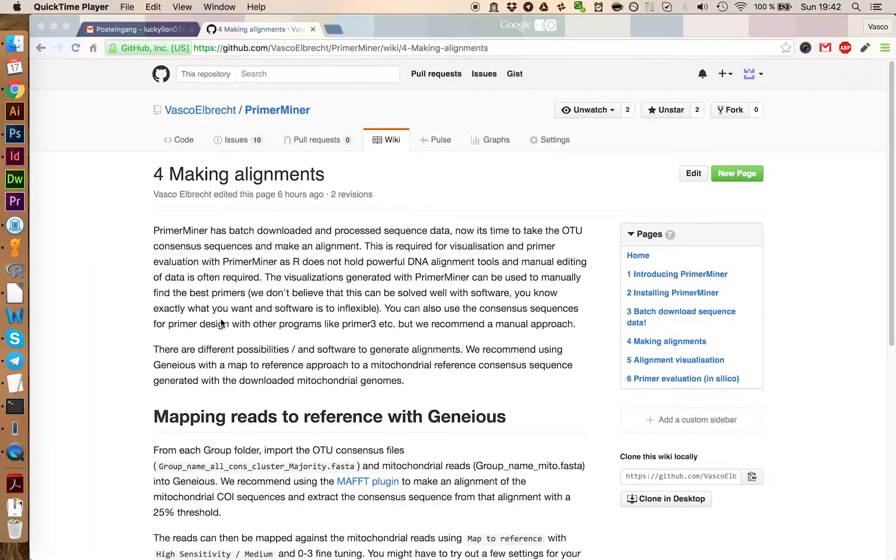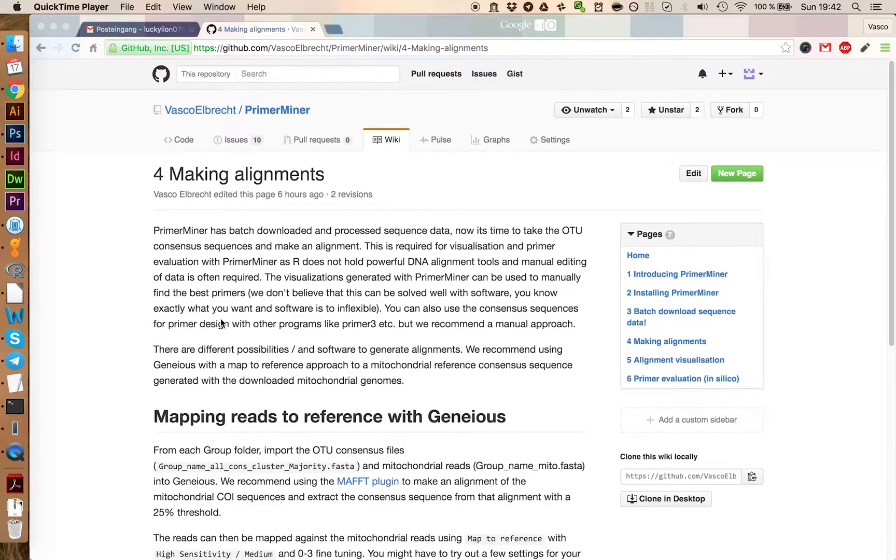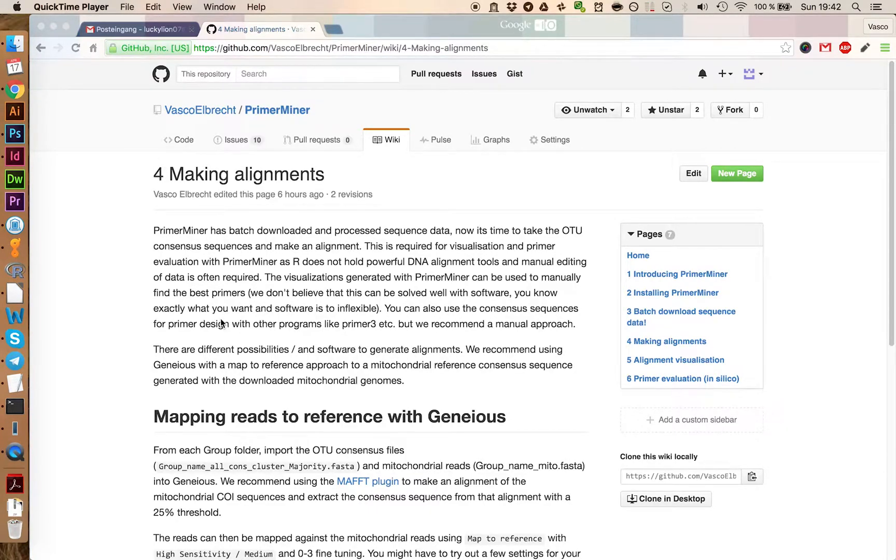Now, we have clustered and downloaded all the data we need. The next step is to convert the OTU data, the OTU consensus sequences, into sequence alignments. We are going to use Geneious to do that.